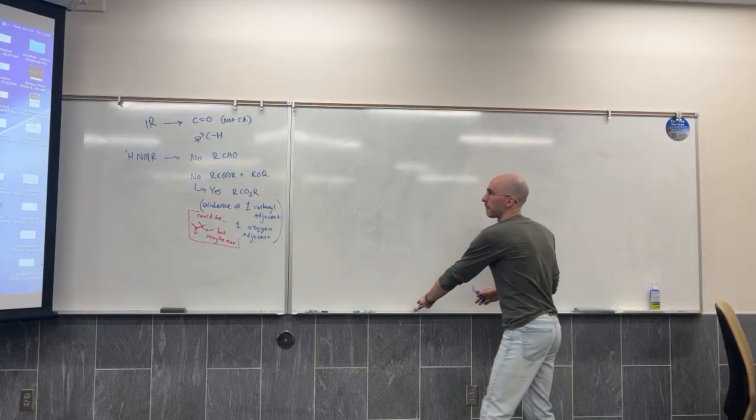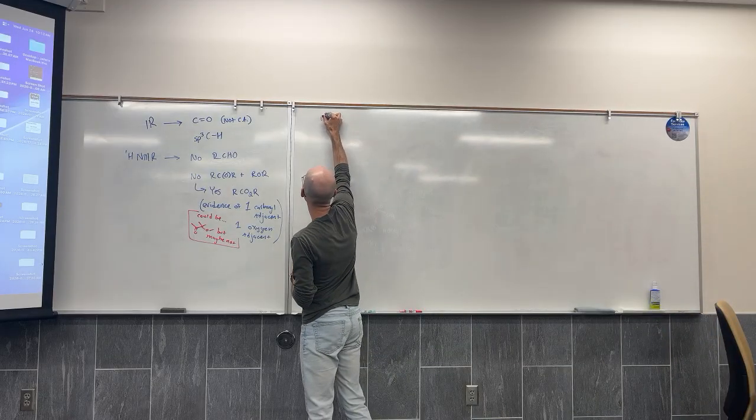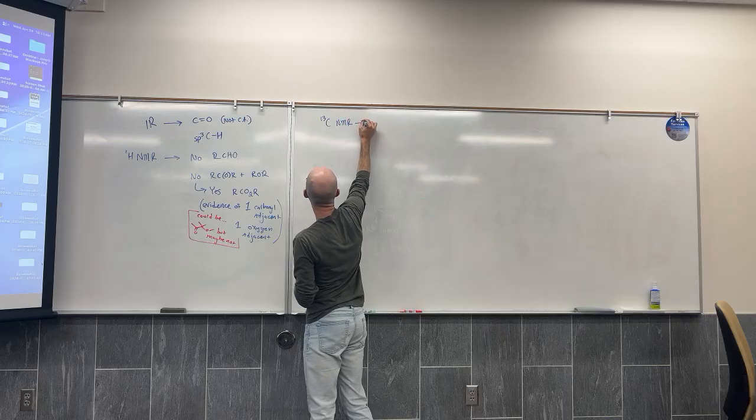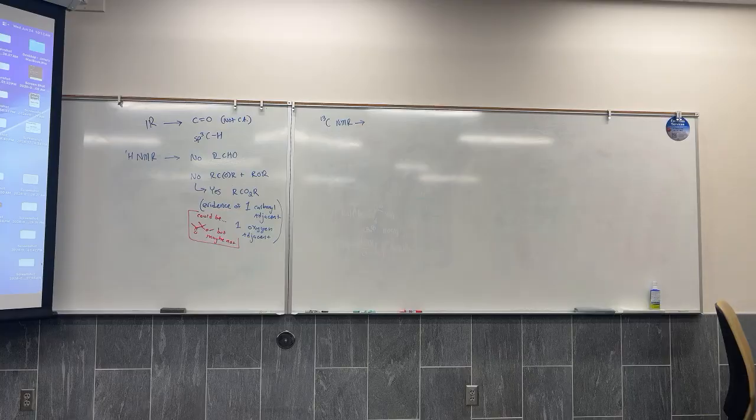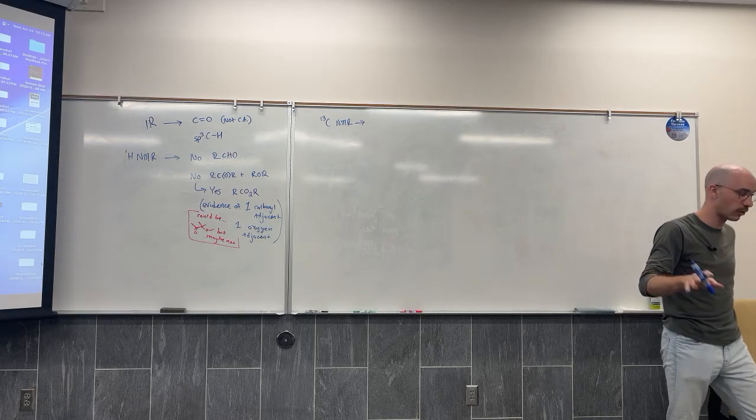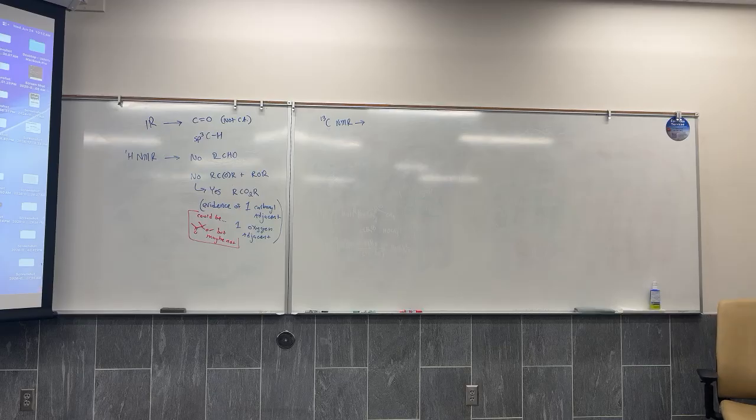If we look at the carbon NMR, and I'm not asking you guys to be experts on the carbon NMR, because I am not quite confident that I'm going to even put any questions on your exams related to the carbon NMR. But in the carbon NMR, we can see that carbonyl carbons show up in the high hundreds, low 200s.